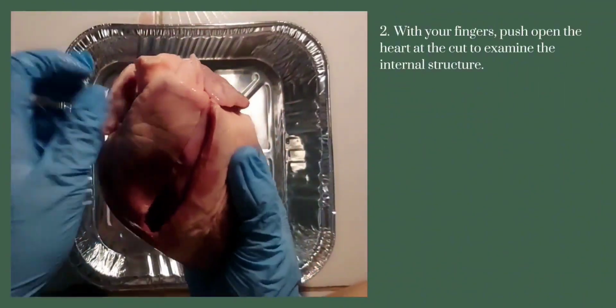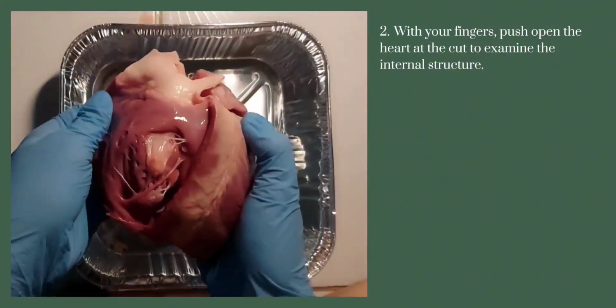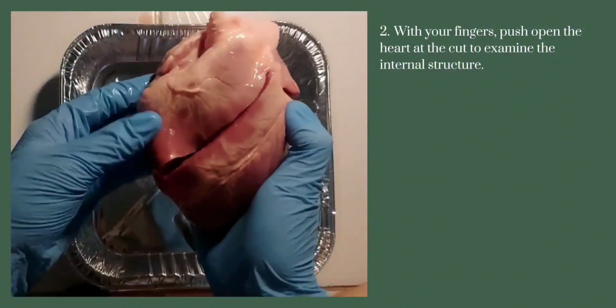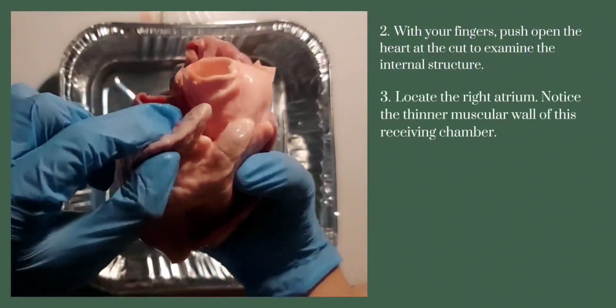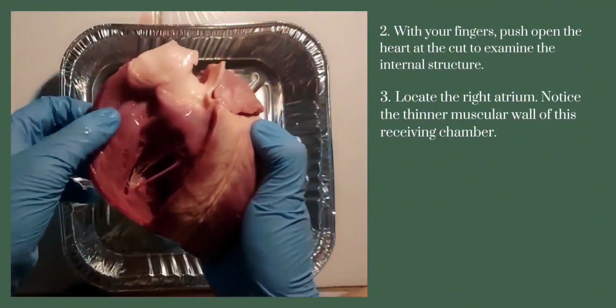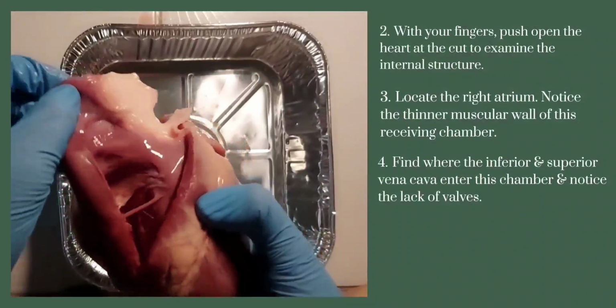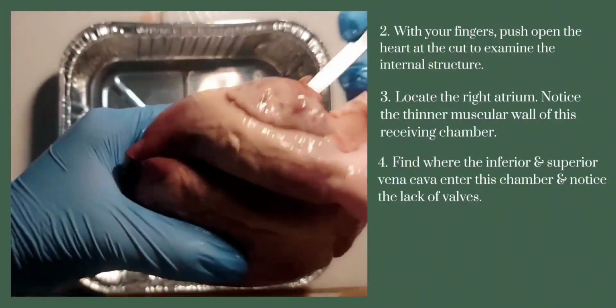With your fingers, push open the heart at the cut to examine the internal structure. If there is dried blood inside the chambers, rinse out the heart. Locate the right atrium. Notice the thinner muscular wall of this receiving chamber. Find where the inferior and superior vena cava enter this chamber and notice the lack of valves.